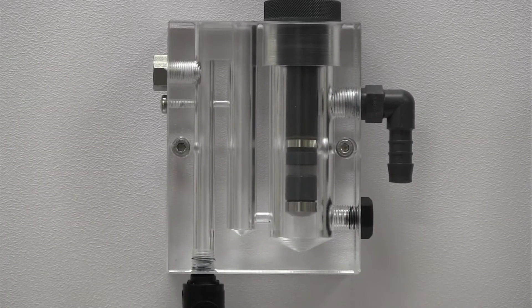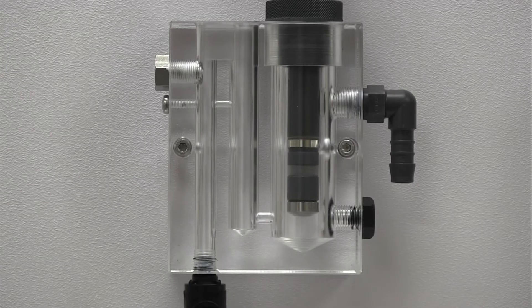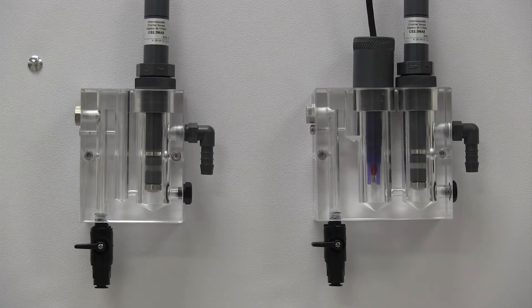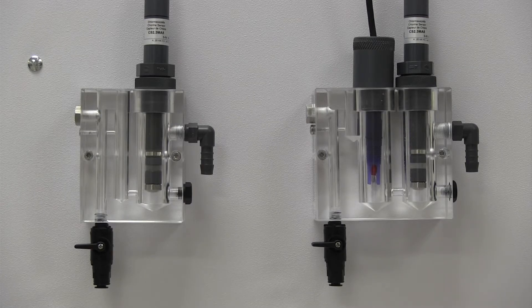The sensor flow cells are essential to the proper performance of the analyzers. A dual chamber model is also available for use with a second probe, such as pH or ORP.